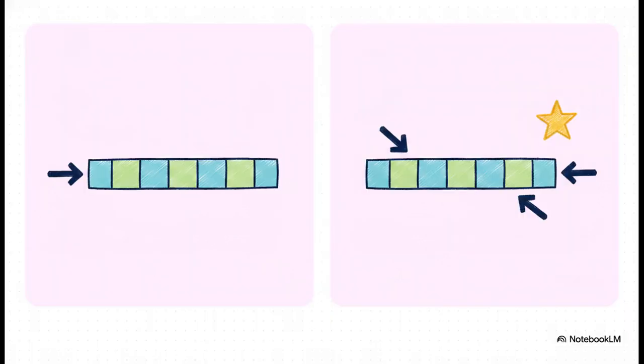Now, here's where it gets really interesting. We have two main ways to actually sequence those fragments. There's single-end sequencing, which just reads one end, either the 3' or the 5' end of the cDNA, and then we have paired-end sequencing, where the machine reads both ends. Paired-end sequencing is fantastic because it effectively gives us double the data per fragment. And as you'll see, having double the data is absolutely crucial for improving how well we can align those reads later on in the pipeline.